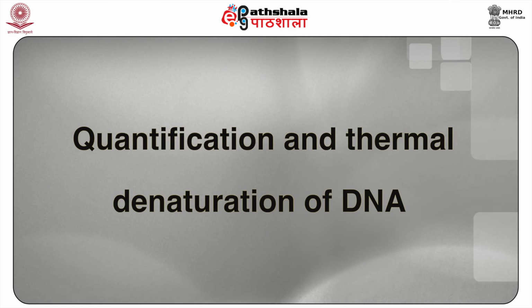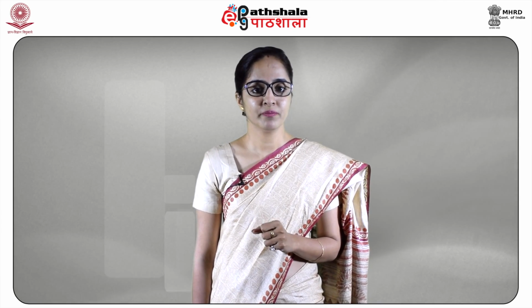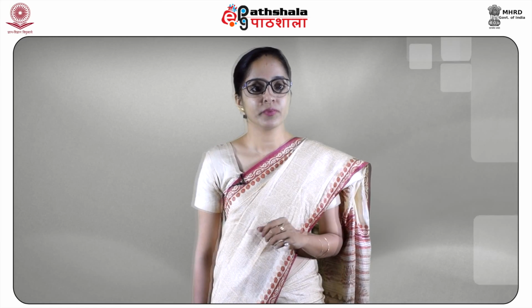Now the next is the quantification and thermal denaturation of DNA. Now students, this is a very specific example and it determines the concentration of DNA in single stranded and double stranded form, and it shows how important UV visible spectroscopy is in various fields. Now UV visible spectroscopy can be used to estimate the nucleotide composition of DNA. The two strands of DNA are held together by both AT base pairs and GC base pairs.